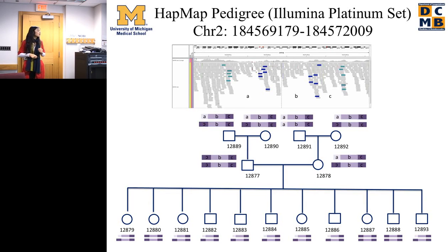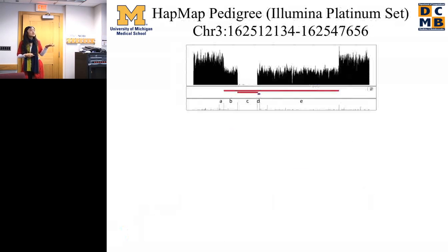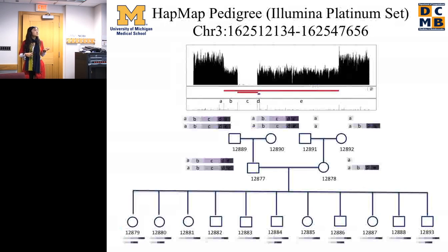And when we look at their kids, this is the result we got. Several kids are homozygous variants, while some are heterozygous, and there are no normal kids here. And the pedigree follows the Mendelian principles, even though we haven't tried to validate all the structures in the real lab. Also, we tried the bigger challenge we have here, which is the overlapping events on chromosome 3.